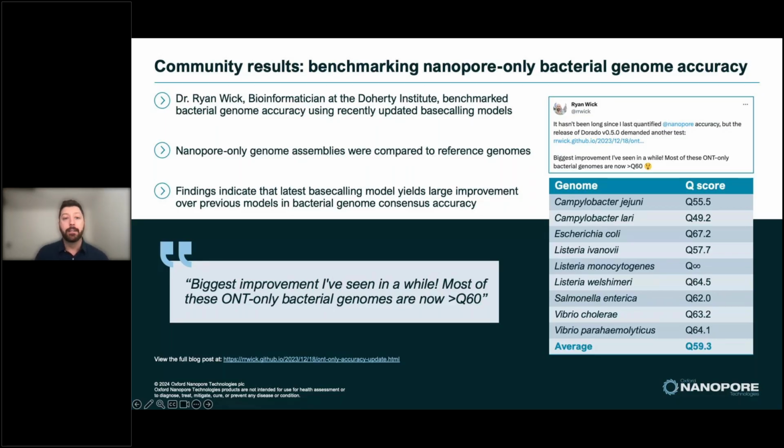So that's excellent. That means that you can really use this as a standalone tool to give you high resolution data, such as calling SNPs or for outbreak detection. And that's quite nice from a cost savings perspective and a time saving perspective.